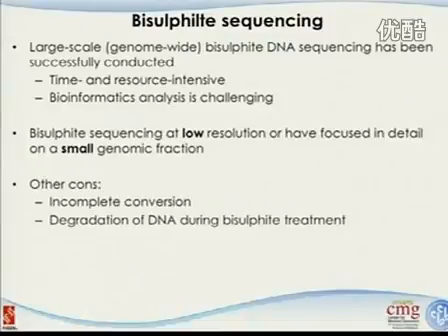Okay? And then they run a gel of the fragmented DNA, and some of the parts are pretty big, others are pretty small, because it purely depends on where those restriction enzyme sites are, right? And then you do the size selection. You just focus on a small percentage of it, and then use those to further do bisulfite treatment. Now, you're missing a lot of information.